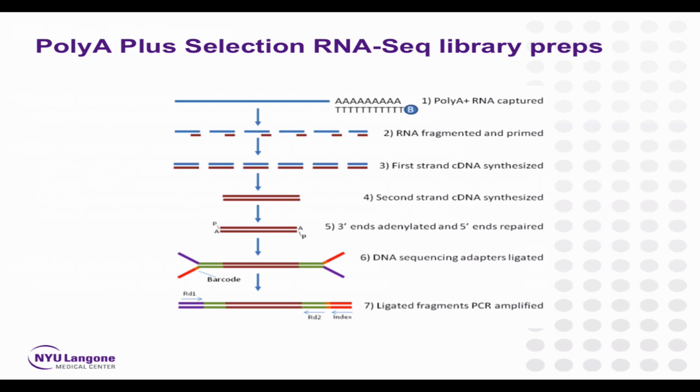So basically in Illumina, you end up doing 2 reads, or you can choose to do only 1 read. So it could be single read or paired end. And in addition, there's also an index sequencing read, which identifies which sample the reads came from when you're multiplexing different reads.